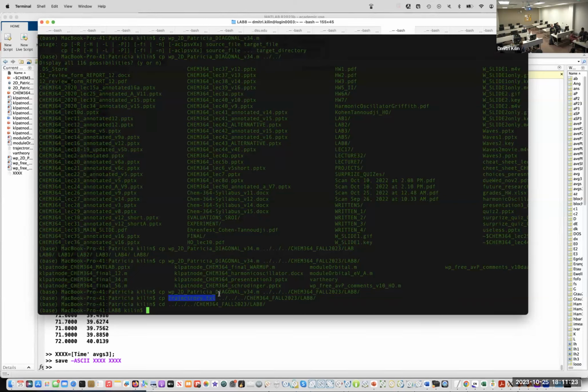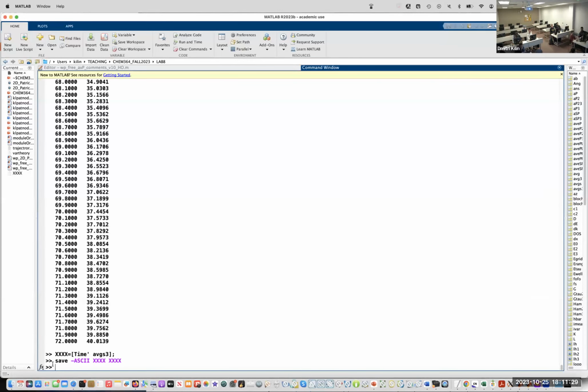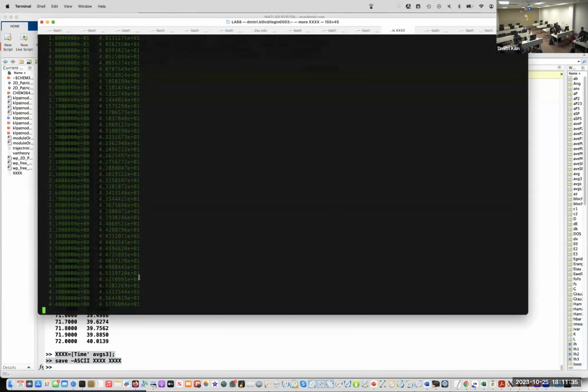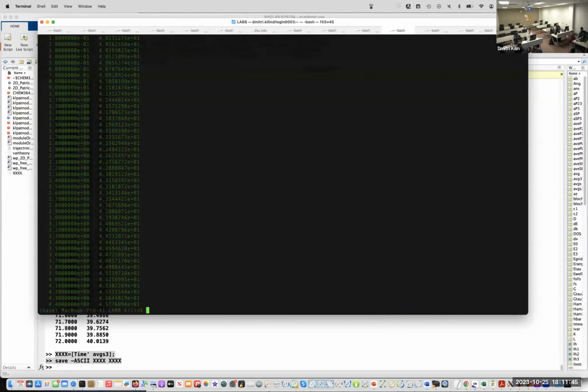So in MATLAB, I just created and saved this variable quadruple X. Then I open it in whatever editor, and you see these values of time and values of X, and I can open it in whatever plotter I prefer. I hate Origin.